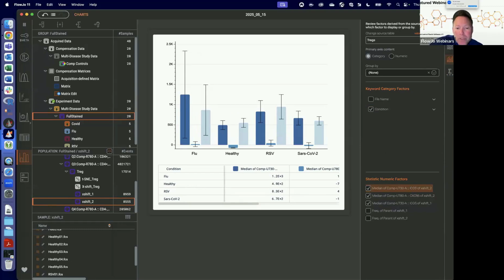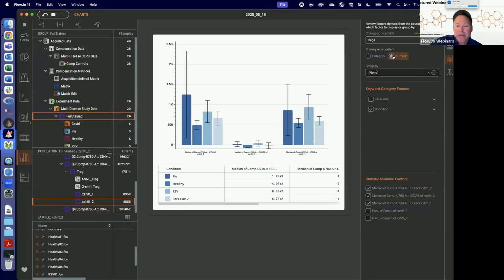Okay, there we go. So one very low median across all the conditions it looks like. Again, we could switch it to compare particular medians and use the colors for the conditions. Up to you how you'd like to do it. But now we've got two different charts, and you can control all of them just by checking and unchecking.